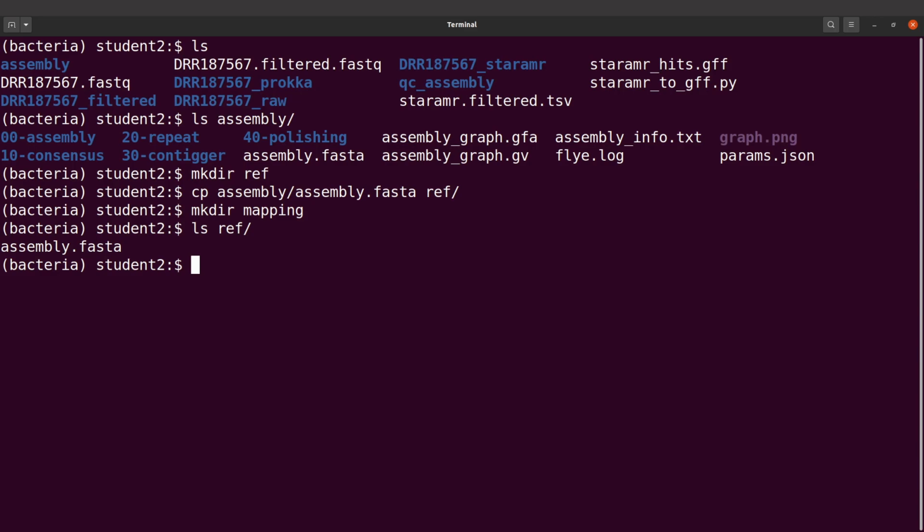All right, so let's run Minimap2. So I'll say minimap2, now say -ax, now say map-ont, and I'll say -t, that's the number of threads. So here I'll use 6, but you can use 8, 10, or whatever you have available. If you have more than 10, you can specify it. If you are working on a Linux cluster, an HPC system, you can have more CPU cores, so you can increase this number to 20 or whatever, but I'll use 6 because I am working on my normal laptop.